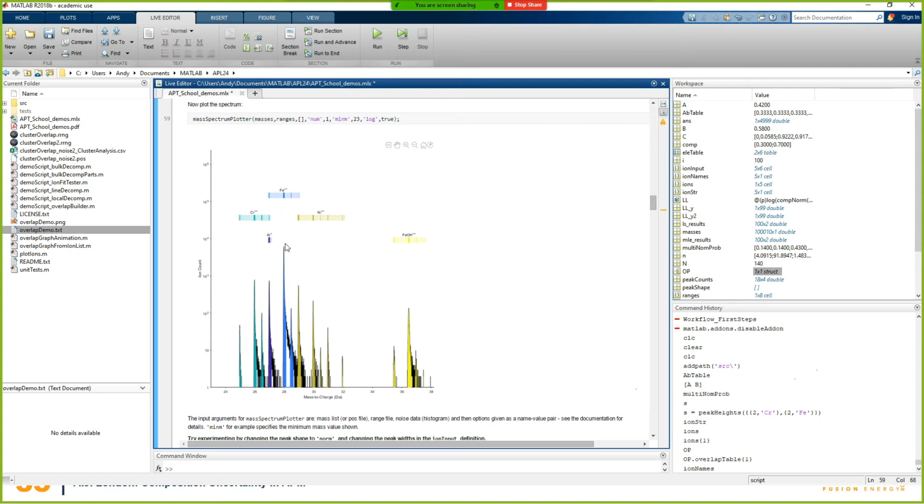In biology, they often have very complex molecules, and you just want to represent where they are roughly. You don't necessarily need to label each individual peak. And then I came up with this kind of bar or spectral format to show where the peaks are, and the width of these bars actually indicates their abundance.